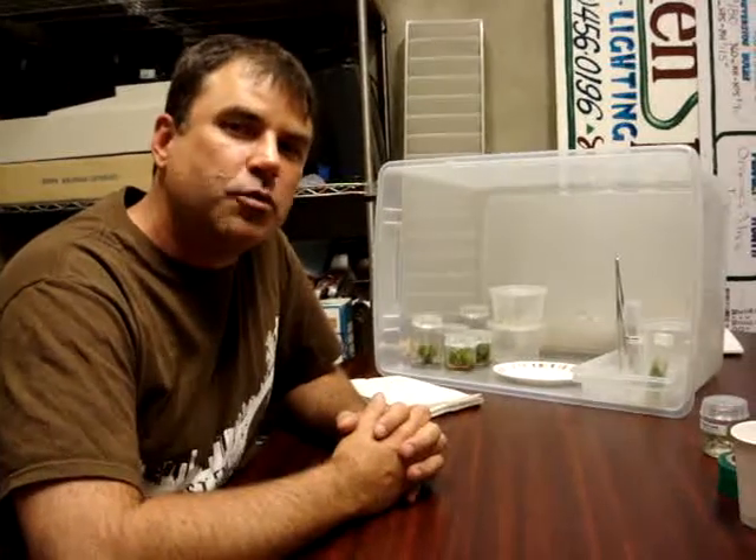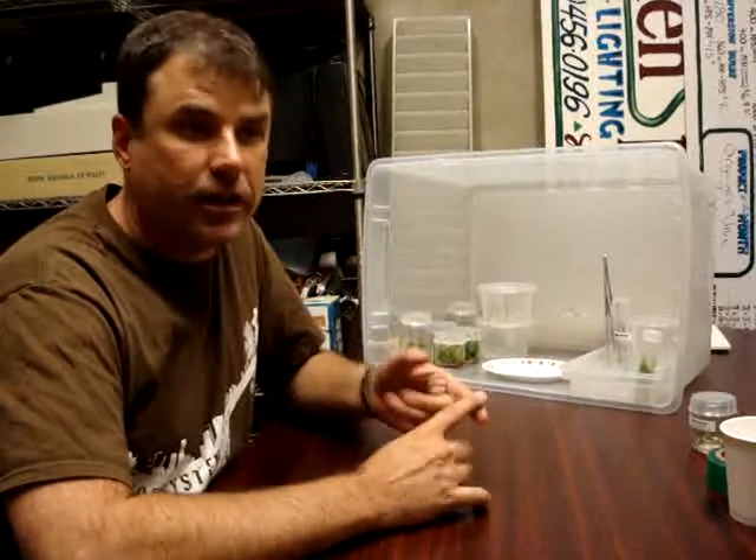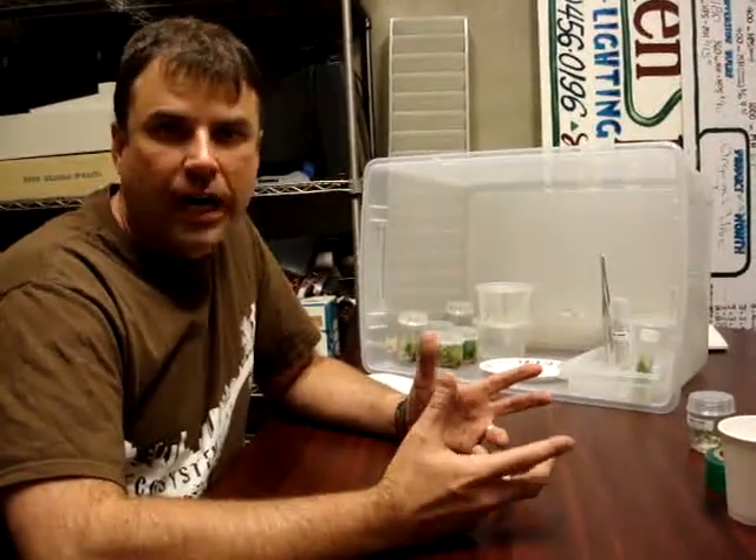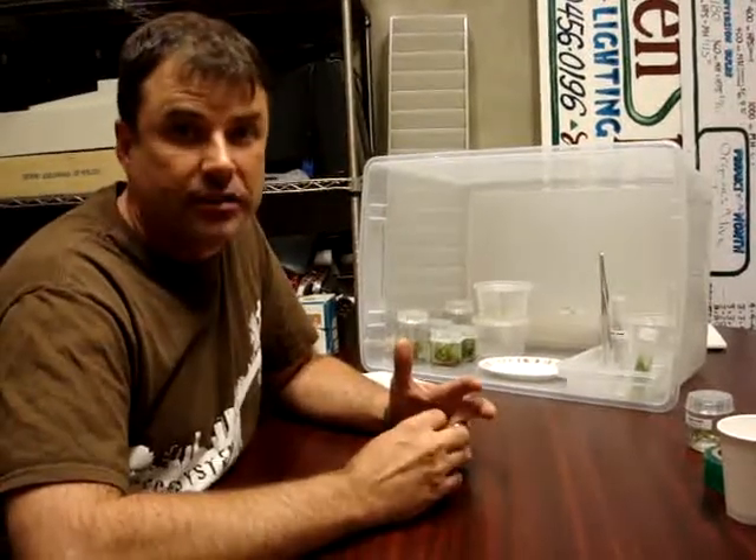I'm going to give you the whole thing just like you were sitting down at the trade show. I'm Bill Graham. This is the SuperStars Plant Tissue Culture Kit. Plant tissue culture is what the commercial nurseries do to propagate their plants when they're not grown from seeds. The system is all driven by growing the plants on a gel of sugar, agar, nutrients, and hormones.